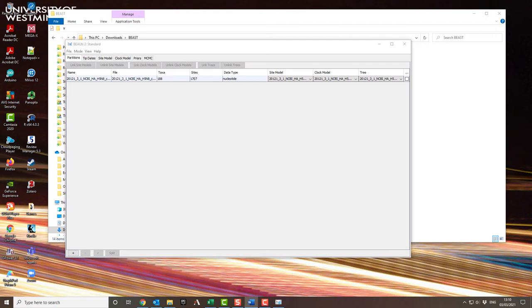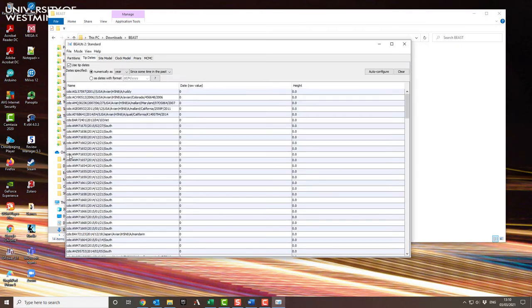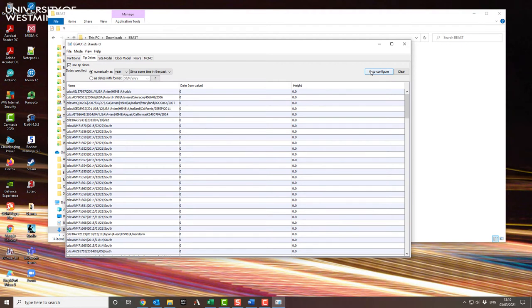So if you look there along the tab, just under the file menu, there's tip dates. Click on that and I'm going to use tip dates. So it will show you a list of all the sequences in the file, and I'm going to use auto-configure to automatically find the dates for me.